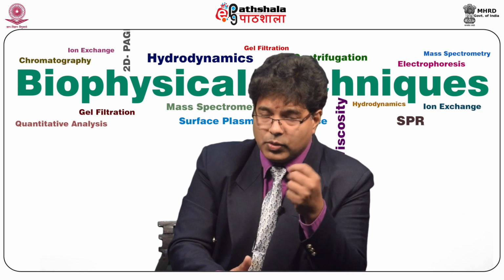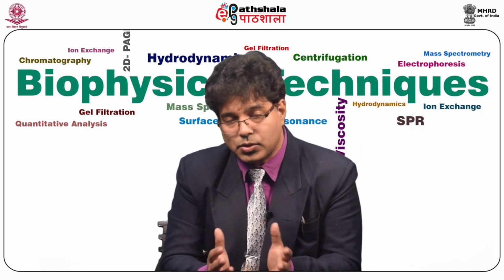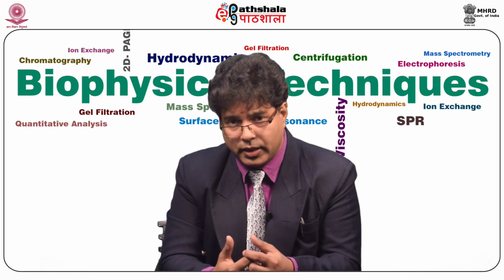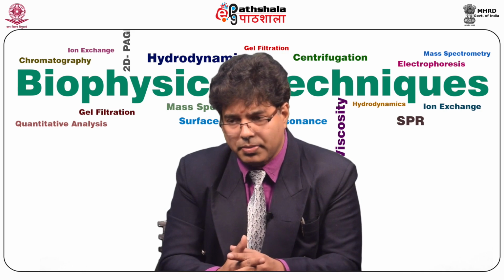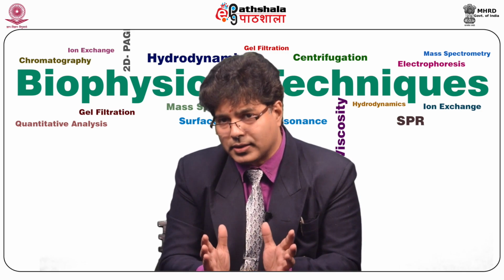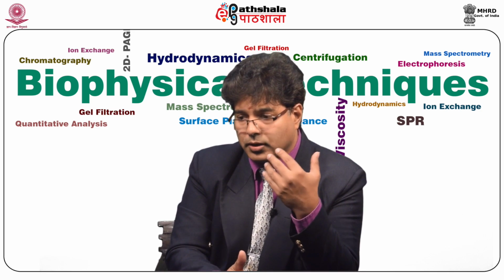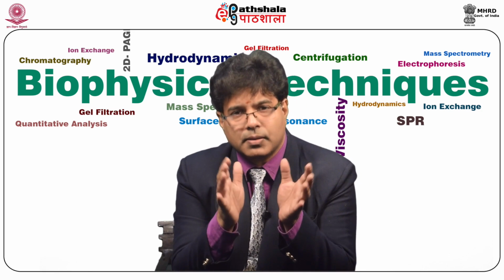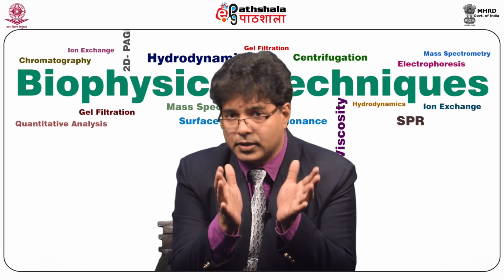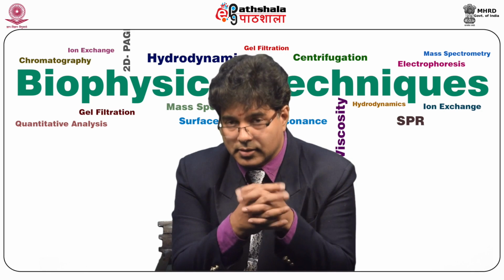In the 19th century, when J.J. Thomson was developing this, he was trying to analyze isotopes, though his interest was something different. Those days they were trying to identify new compounds. They found the same atomic number but different atomic weights. This came up when they tried to adopt the Rutherford atom model, and found something interesting. Therefore, they wanted an analytical instrument which could differentiate and analyze this.